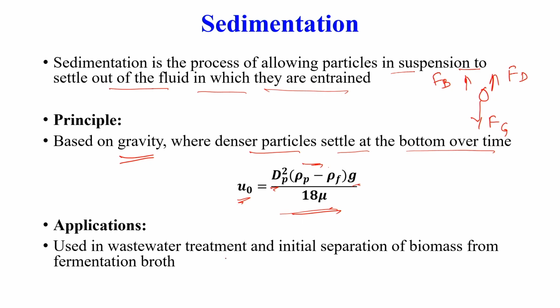It is also used in wastewater treatment and initial separation of biomass from the fermentation broth. We will not discuss sedimentation in more detail, rather we will see one example based on sedimentation.